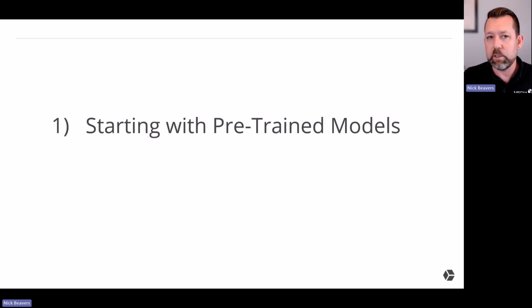And we're going to talk about what a pre-trained model is today a little bit, but this is really where we see things going into the future, where more and more software platforms and technologies will utilize a model that has some understanding of the ground truth information. And you're going to choose from, as we move forward, some type of starting point that already has knowledge. And this really improves your time at trying to get a start. We find that pre-trained models can take anywhere from minutes, hours, days, or weeks to train. So it all depends on the complexity and how much it knows of your sample. But starting with that is a huge efficiency boost.